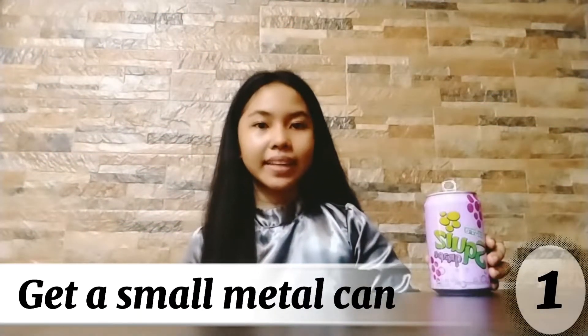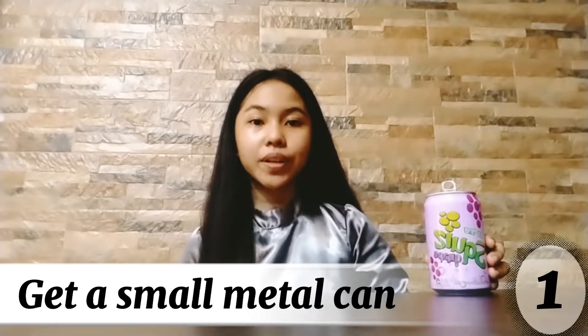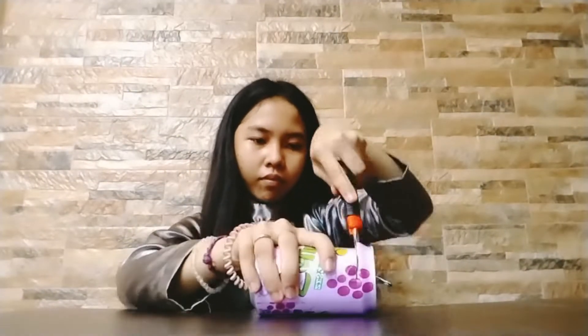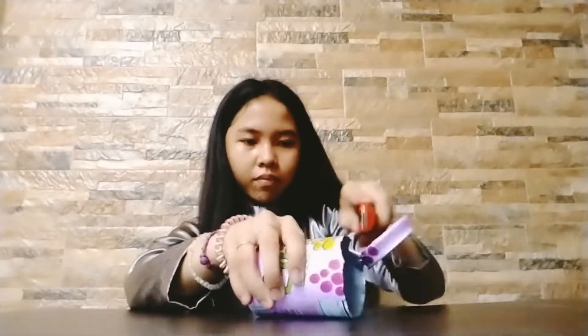First, get a small metal can. This can will be used to contain water that will be heated as part of the calorimeter measurement. If you are using a soda can, the opening used for drinking out of the can will suffice.